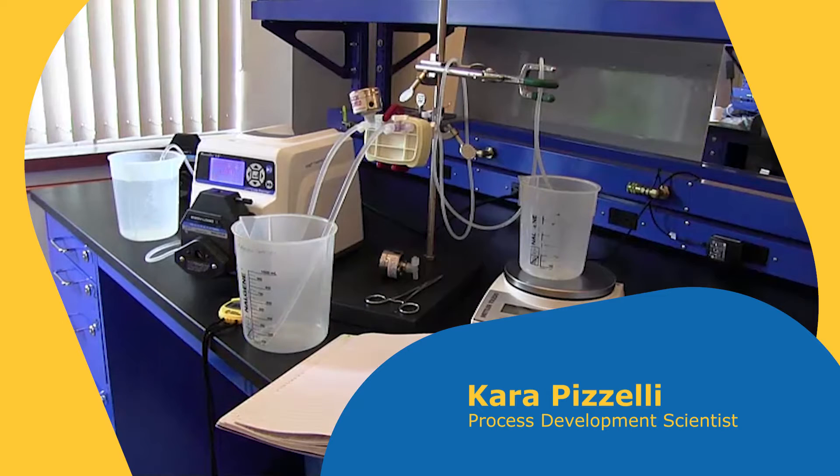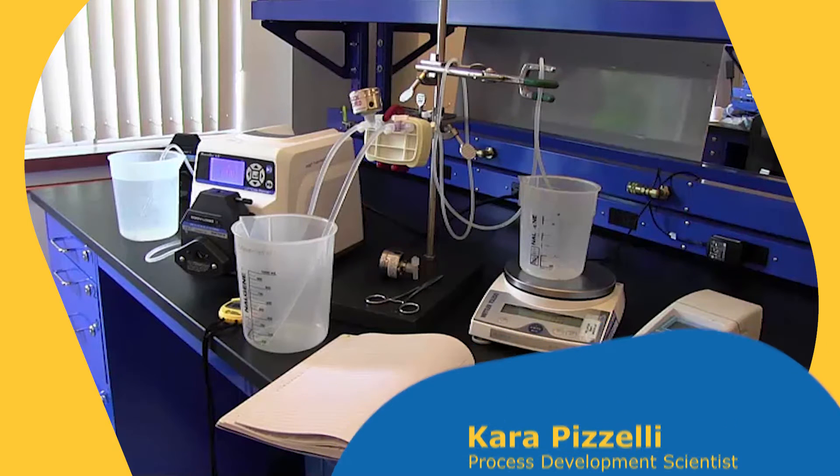Hi, I'm Cara Fazelli, I'm a Process Development Scientist, and I'm here today to show you how we're going to set up and run a PMAX experiment.